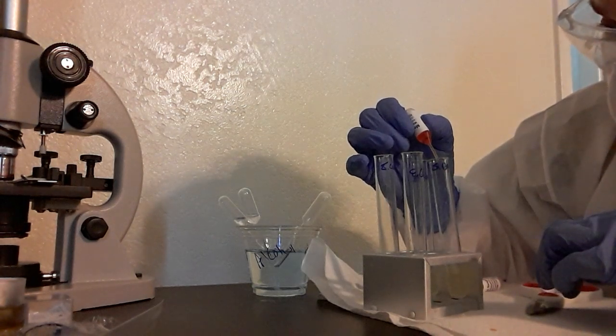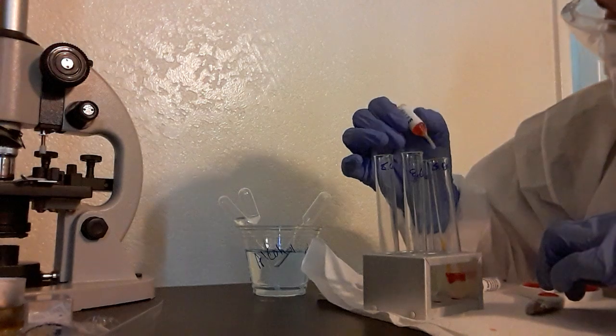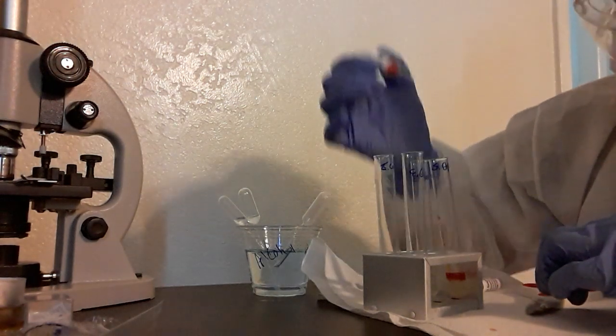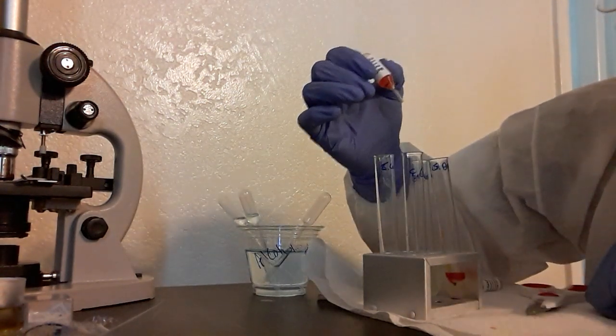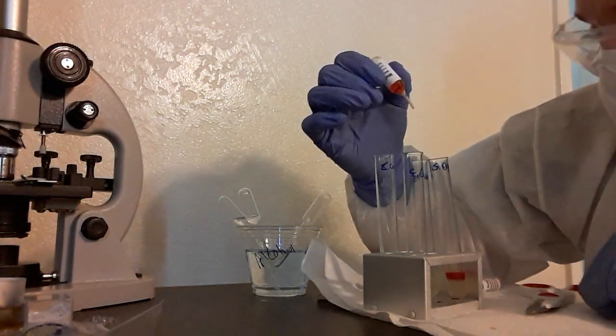So there's one, two, three, four, five, six, seven. Alright, so the red's just kind of staying on top on that one on my epidermidis.